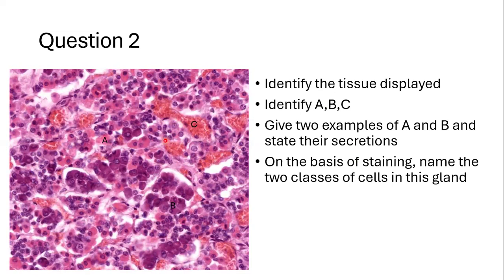For those who had said parotid and submandibular, I know these basophilic cells are confusing you with the serous acini. But the way you differentiate these from the parotid is in terms of the capillaries. These sinusoidal capillaries, these sinusoids, are extensive in this organ. That's how you can differentiate this from a parotid.